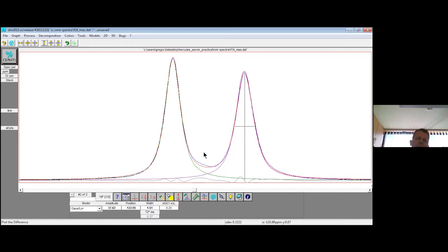So it has a little bit of dispersion character. That's why we don't have a very, or extremely good matching. It's a good matching to determine the intensities. It's just fine. But I think that it was a little bit badly phased before it was exported, and that's why we don't get an excellent agreement.